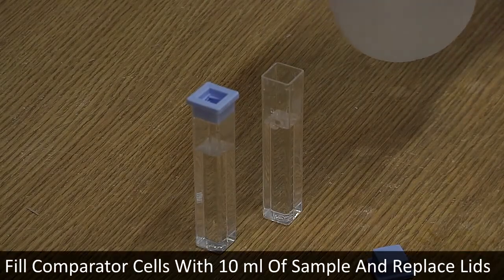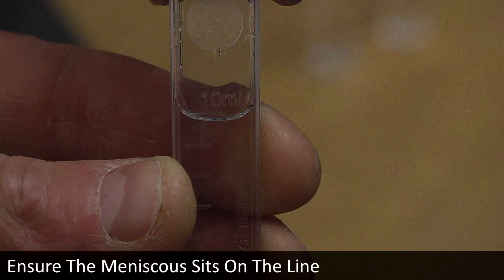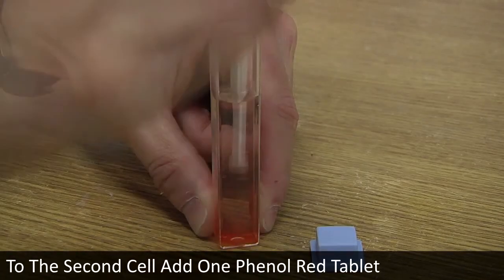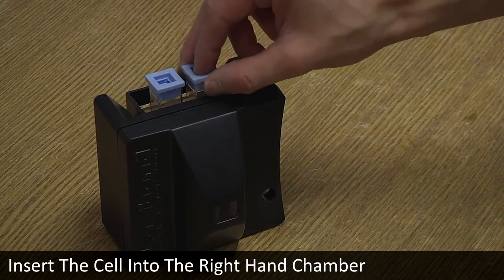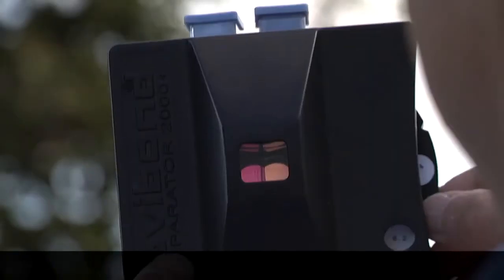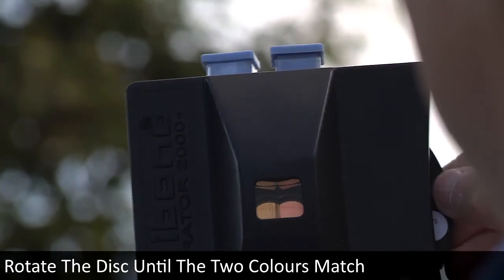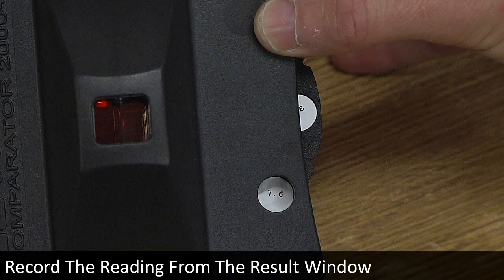Fill two clean dry comparator cells with exactly 10 millilitres of sample and replace the lids, ensuring the meniscus sits on the line. Insert one cell into the left-hand chamber. To the second cell, add one phenyl red tablet, crush and mix, replace the lid, and insert the cell into the right-hand chamber. Select the correct disk and slot it into the comparator, ensuring the values are facing towards you. Use a suitable light source, preferably daylight or a Lovibond lighting unit. Rotate the disk until the two colours in the viewing window match. Record the reading from the result window. Empty and clean the cells immediately.